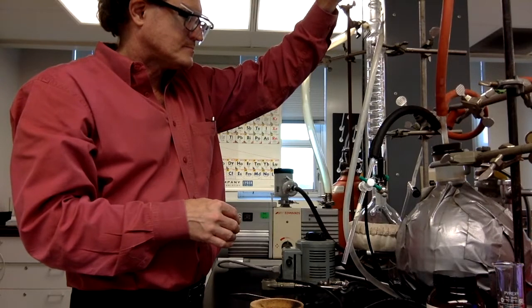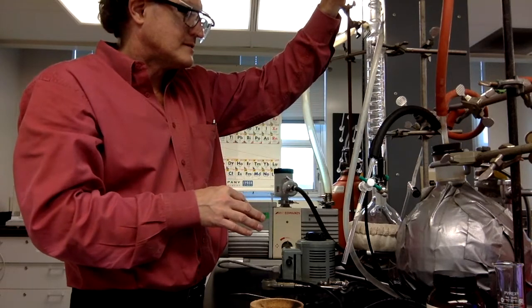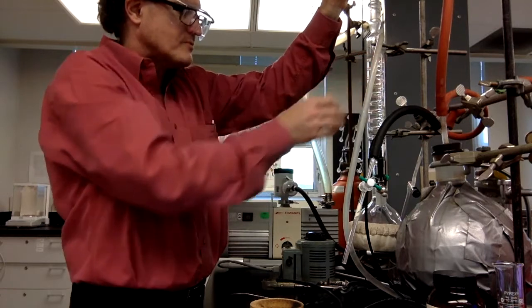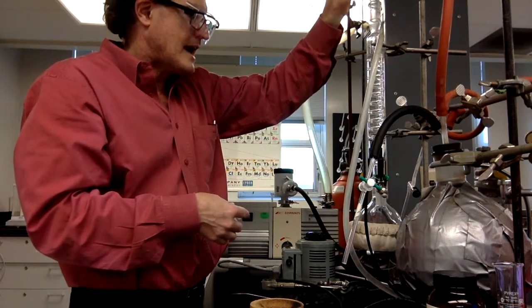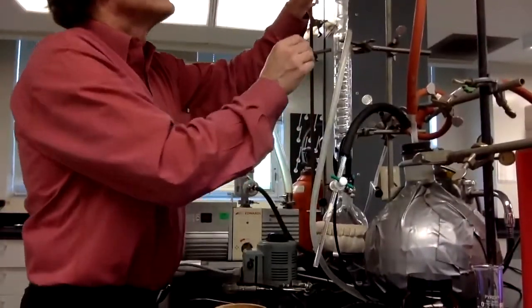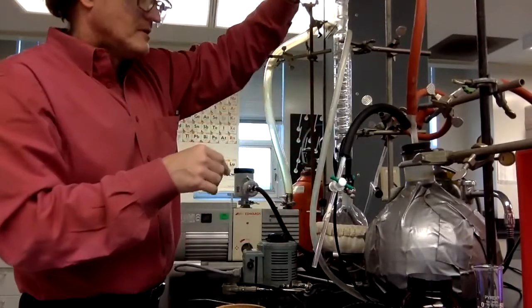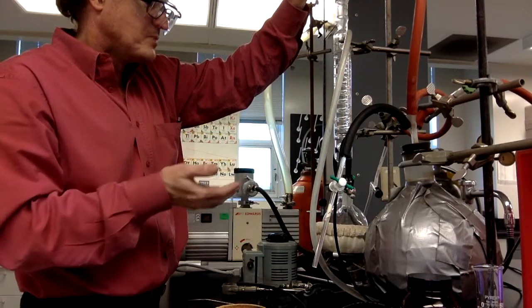and once that's open, that will let the gas start to come out of this region, right? And you can start to hear some, right? And as the pressure drops, you can see, oh, it's starting to boil in there as the pressure is dropping down, right? Okay, so we'll close that off and let it settle down a little bit. Let the pressure settle. Open this up again slowly so we don't get a big rush up out of there.